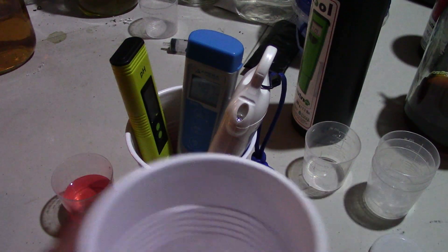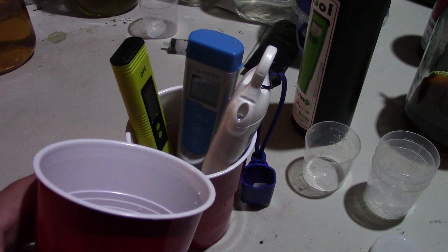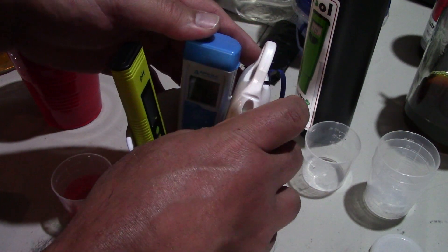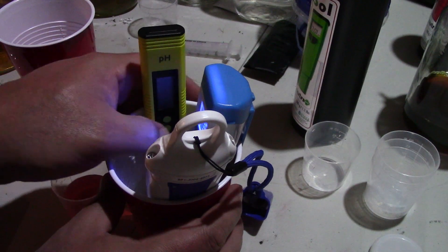Alright, so what I've got in here is some nutrients that I've kind of done up from my seedlings. I've got all three pens in here. So let's turn on some lights, turn on some power, and let's see what we got here.